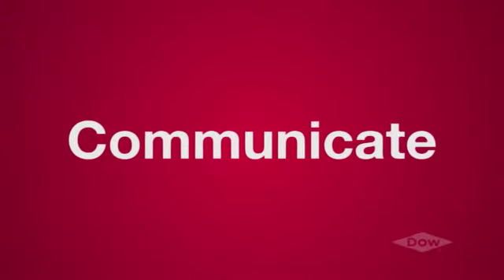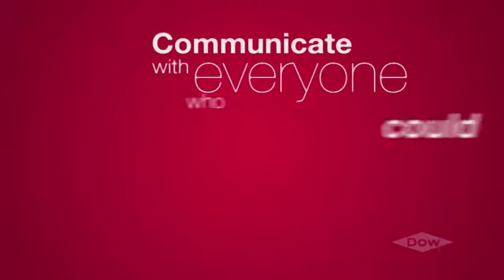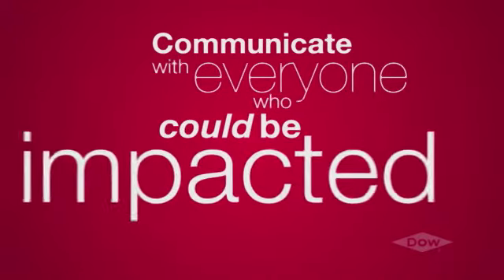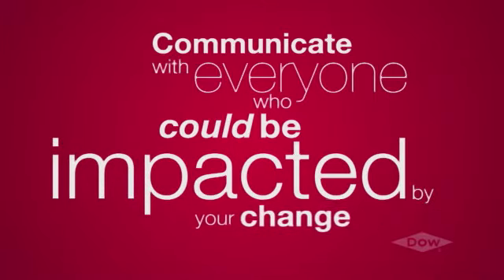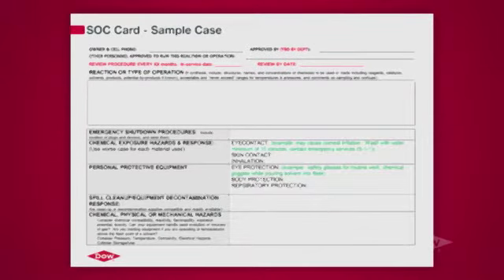The final component of an effective change management process is communication. Your plans must be shared with anyone who could be impacted by them. Discuss the experiments you will be conducting, the potential hazards, worst-case scenarios, and any planned emergency response. By the way, the SOC is a great tool for helping to plan for and communicate potential hazards connected to process change.